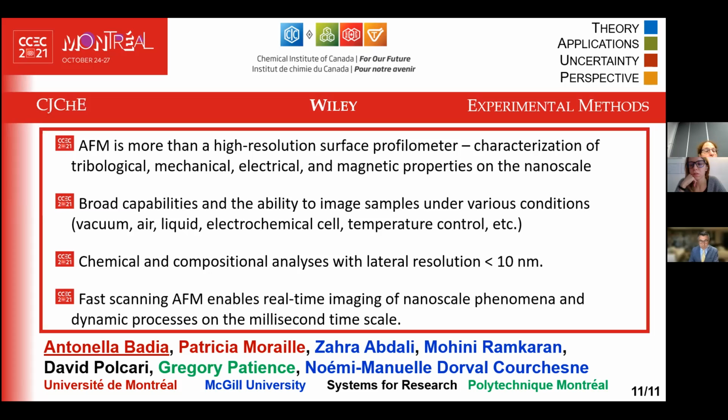So something that's ultra flexible when you need to image soft biological samples, to something very hard when you're imaging conductors or semiconductors. So you can really tune the spring constant of your probe depending on the nature of the sample. And the tip radius is typically less than 10 nanometers.